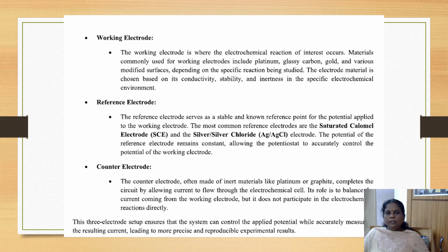Reference electrode. The reference electrode serves as a stable and known reference point for the potential applied to the working electrode. The most common reference electrodes are the saturated calomel electrode and the silver-silver chloride electrode.